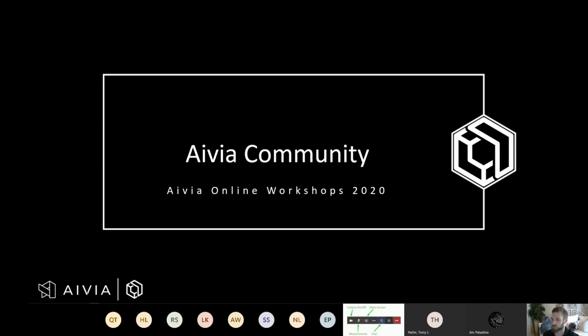Let's talk about Aivia Community. So Aivia Community is, like Jim said, a free tool that we have, and it's for viewing data of any size. So we let you open your data, clip it, slice it, and animate it, and even train pixel classifiers on it without buying Aivia at all. And I'll get into this in a second.